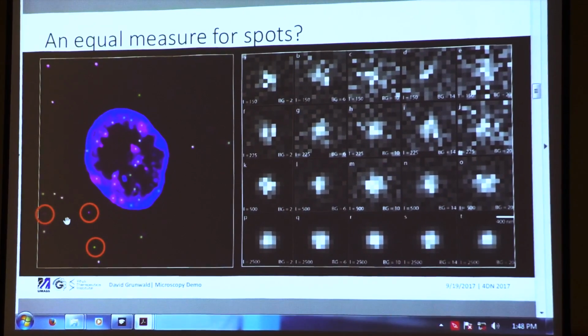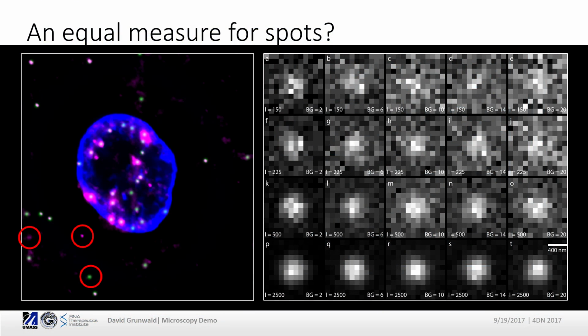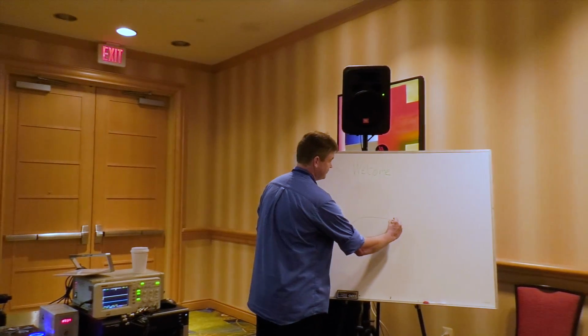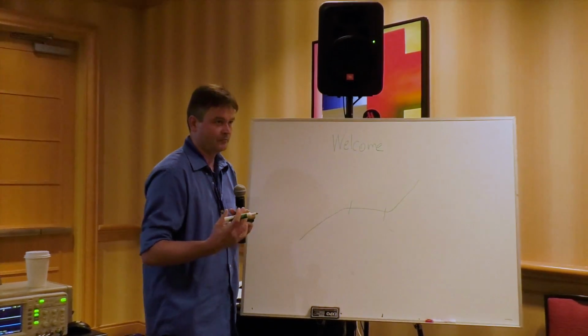Yeah? And the outcome of these discussions is normally, well, if I put the threshold a little bit to the left, I have no signal left. And if I put it a little bit to the right, I have a lot of signal left. Now, why is that a problem? The problem is that a threshold from the theory part should be something where you plateau, right? You have a large change, then a region where it's stable, and this is the area where you threshold reasonably.